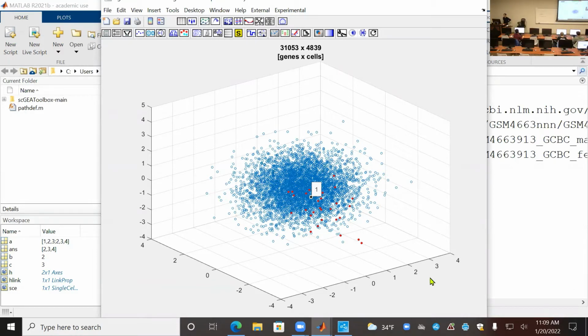Okay, because I'm pretty sure I installed it because it had to restart my Matlab, but I can check and make sure that works as well. Yeah, just do a search and see where this function is located on your machine. Make sure you add this path so you can find it and use it. The statistics toolbox is the only toolbox we rely on. There's only one dependency.